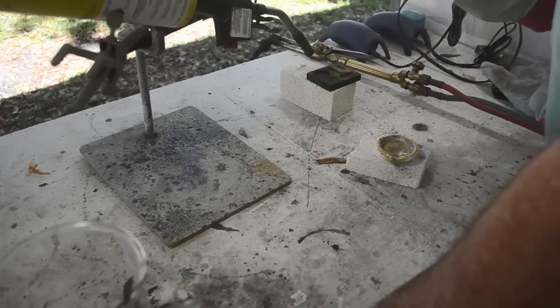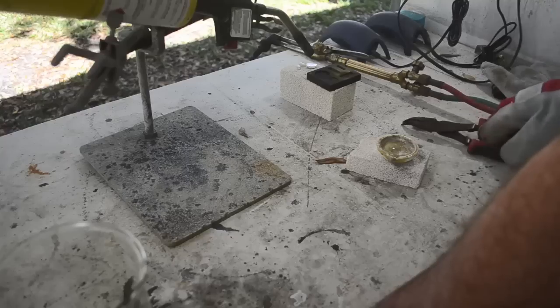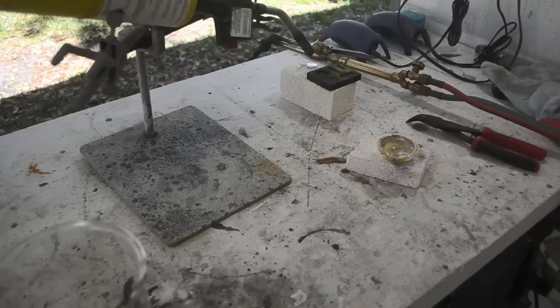That's going to be hard to tell which one's prettier. So I'll let the one that's in the fume hood boil for a little while, get cleaned up, then I'll pull it out, I'll put that one in, and we'll compare them side by side once they've both had a bath in boiling dilute hydrochloric acid. All right, see you then.